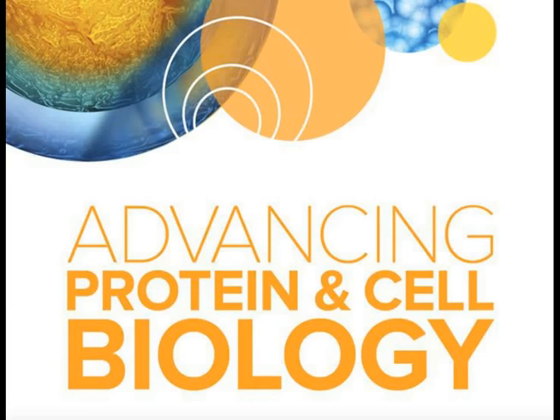It's just a matter of choosing the right dye so it wouldn't fade away or cause toxicity. I would imagine that whole cell stain dyes could be useful for this purpose, or maybe if you use Hoechst stain at a lower concentration, it's also an okay option.